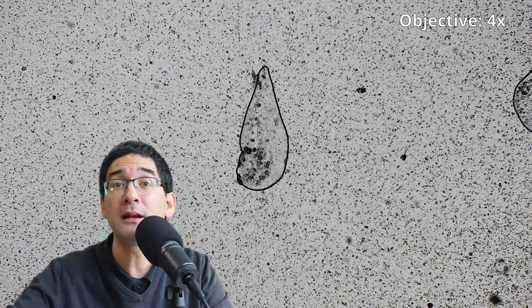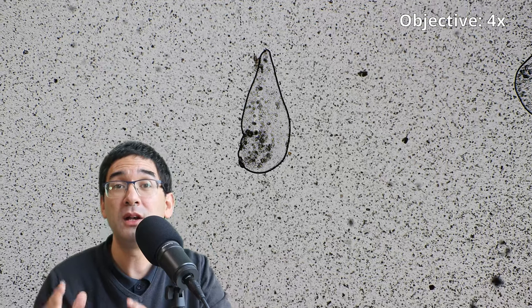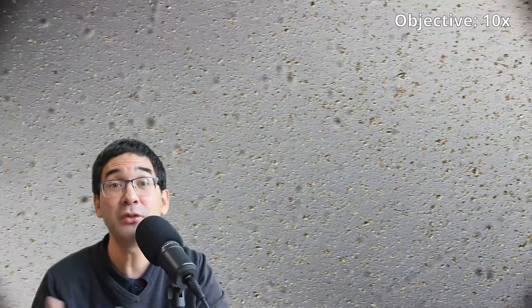But as we go up with a magnification all the way to 100 times, so with the 100 times oil immersion objective, giving me a total magnification of a thousand times, we're able to see very beautiful structures here. I'm going to show this to you.